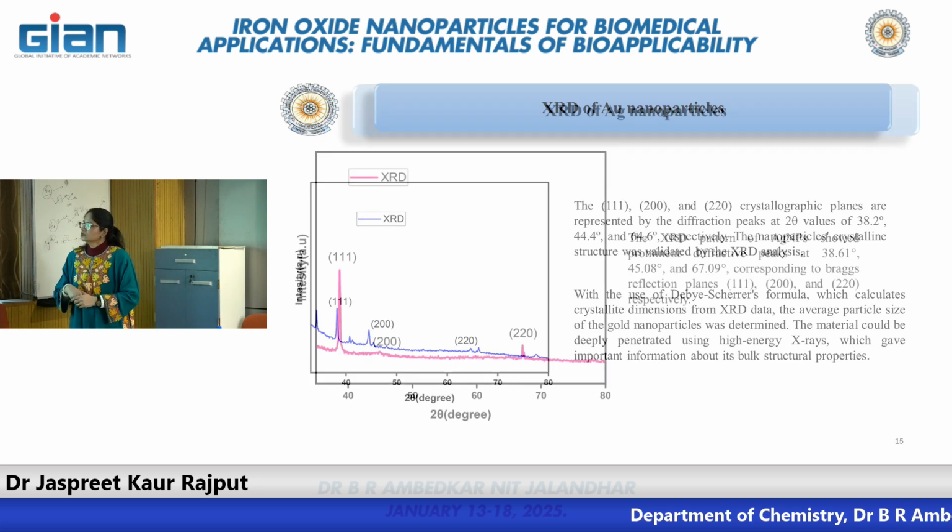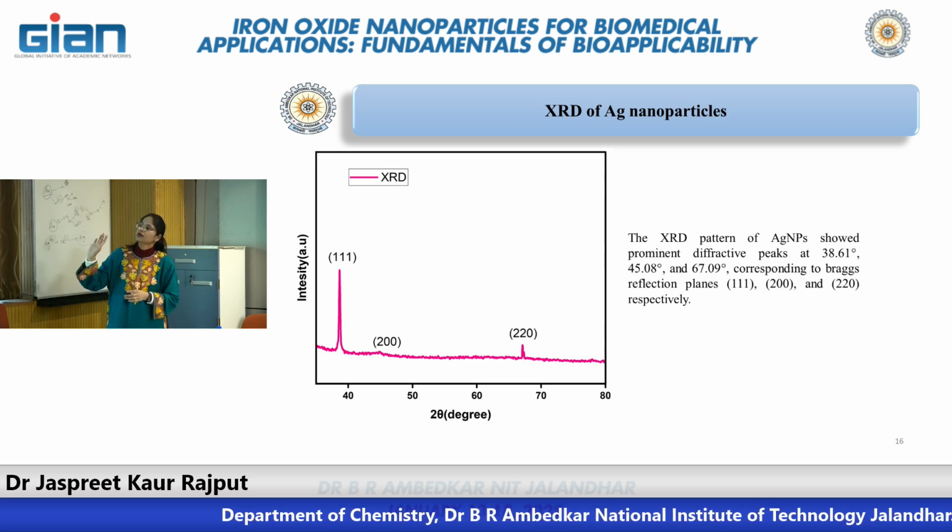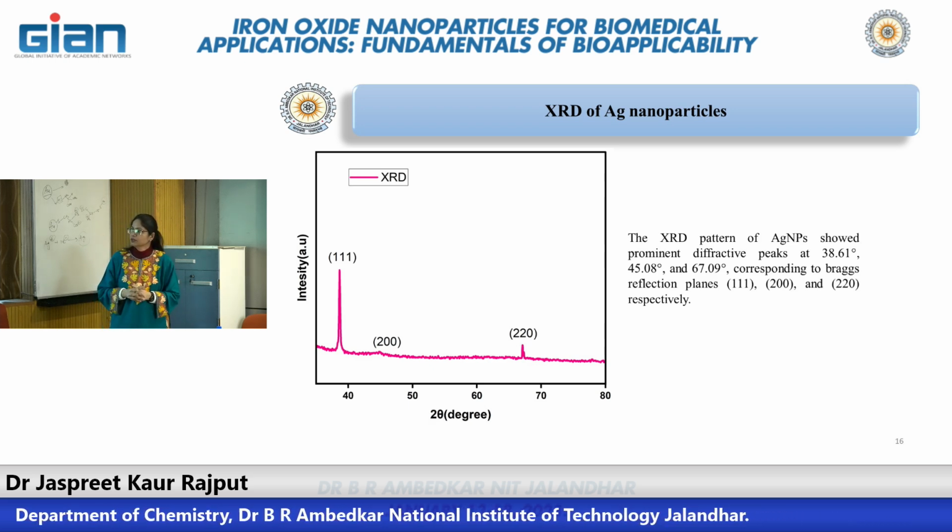Next, this one is for the silver. You can see we have a prominent peak again at 111, 200 and 220.